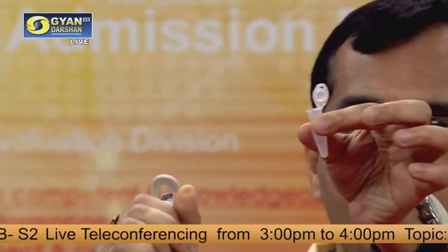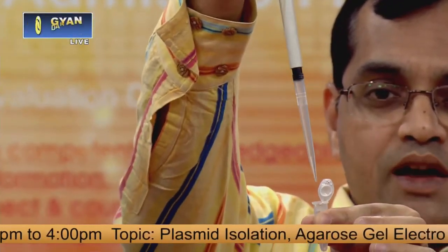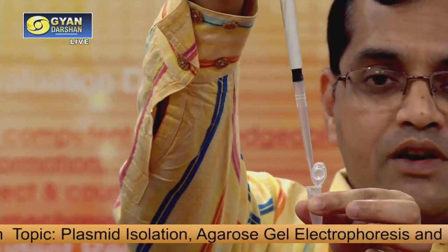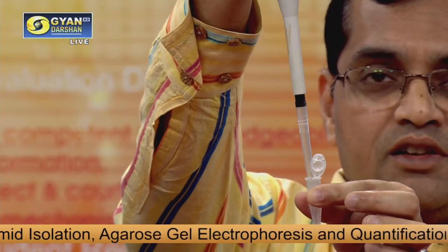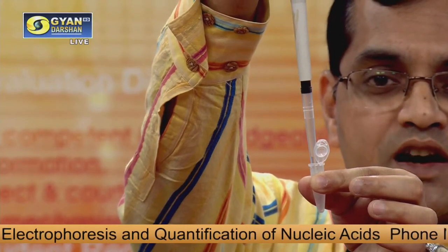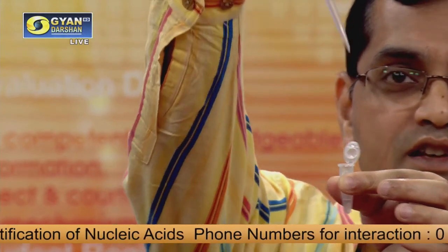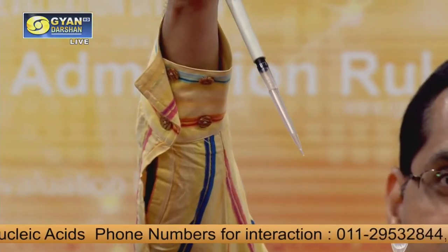See, this is open now. This is the lid. And then you just dip your pipette man inside, and then slowly you just press it up like this. See, it contains the solution.